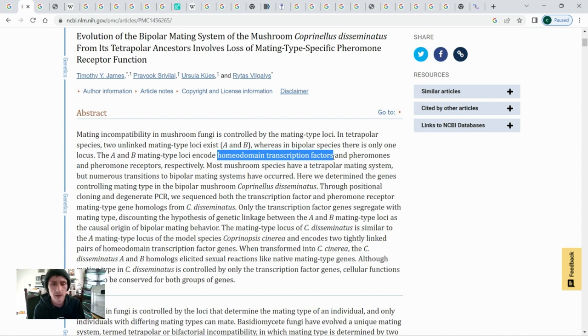This was a topic that I was talking to my buddy about, because mathematically you would say, well, if you have these four factors, it would ultimately break down to maybe a 50-50% likelihood that two spores would mate. And that doesn't always seem to be the case, and it will probably vary with species. However, this is the most universal and reliable information out there, and a very important consideration. So, if you have two monokaryotic cultures of the same species plated together and you wanted to breed them, it's not necessarily a given that they will mate, even though they are of the same species, and that would be why.